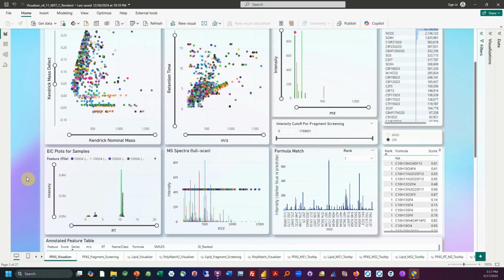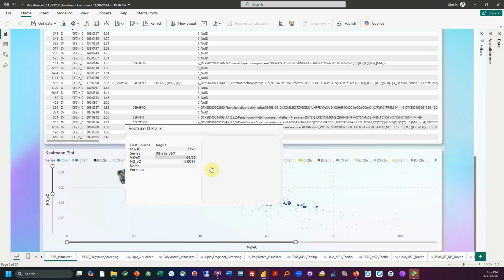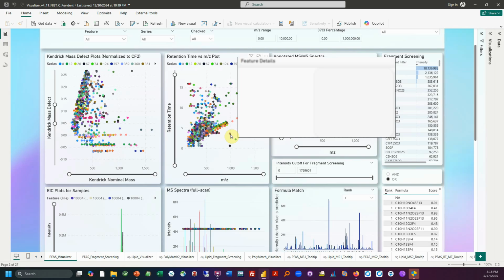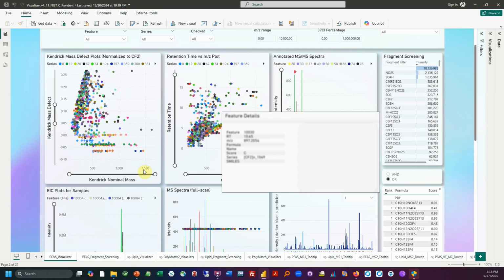And as we scroll down here, we can see that the only dots that are showing now are those within the Kaufmann region. And so you can easily filter and figure out what are likely PFAS within the software platform using this region, and then start to confirm and look through each one of these individual species and see if it's real or not.